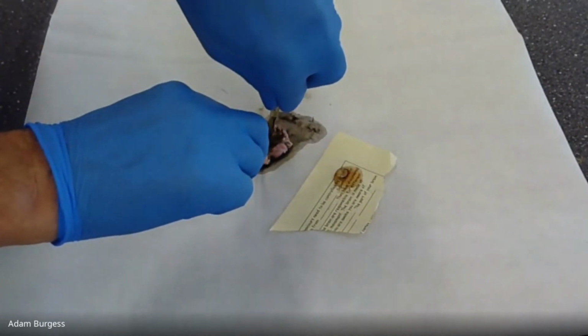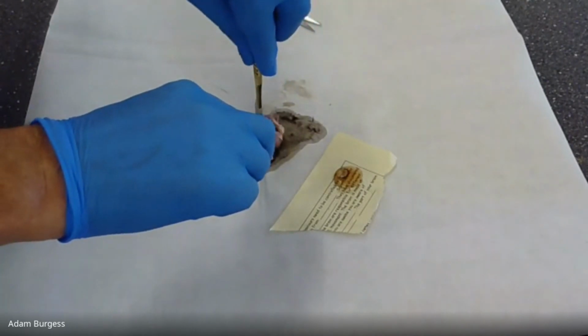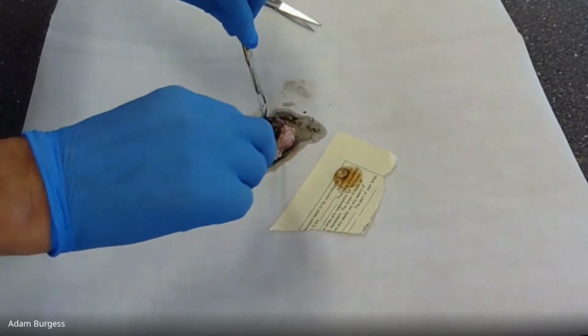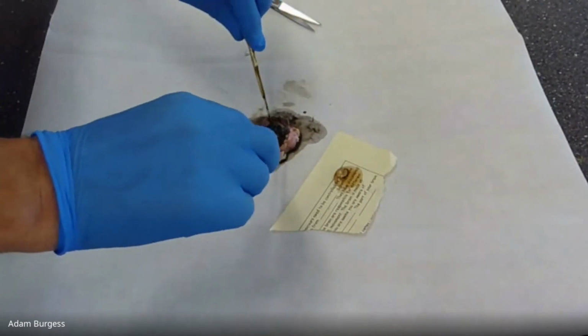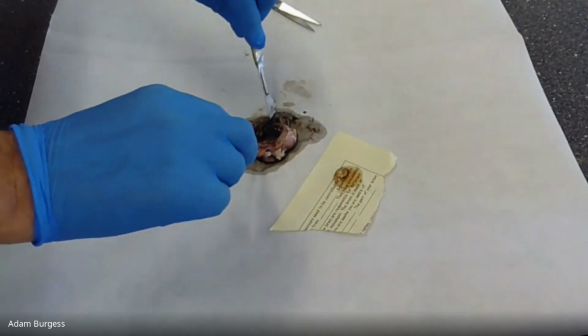So you're going to go in, cut into it, better than I'm doing. And then try and look into the eye and look at the back of the eye, and you should be able to find, there you go, the optic nerve. Got the optic nerve there. And you've got the retina as well.